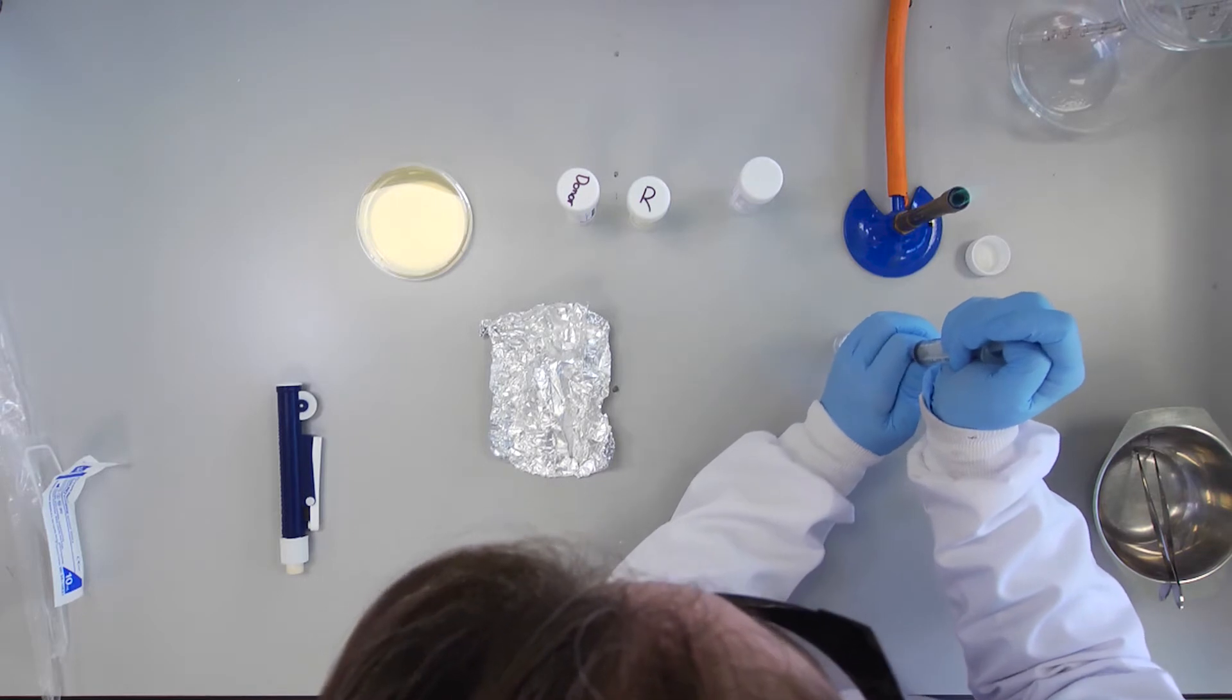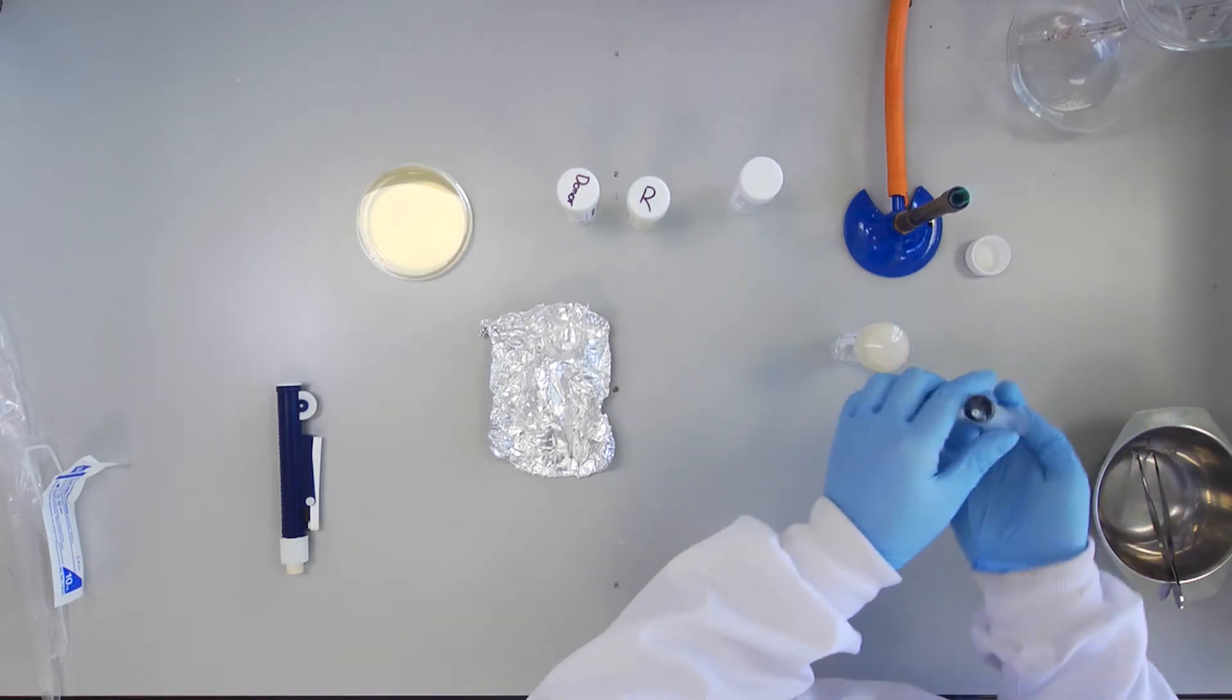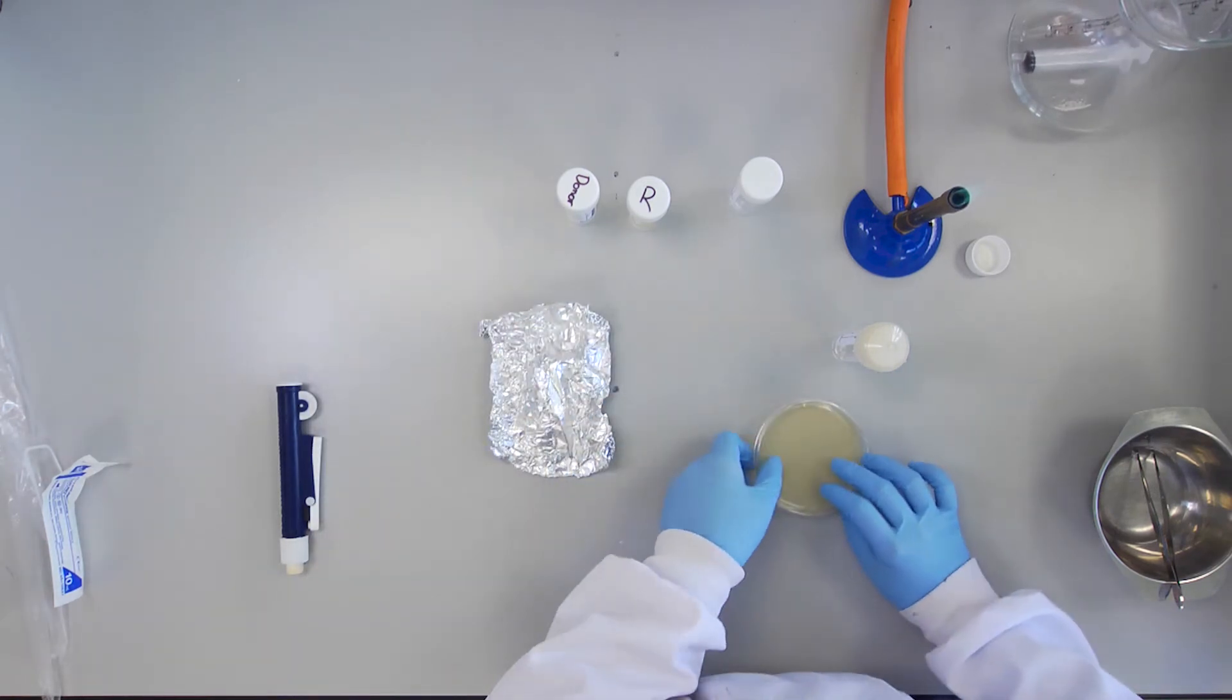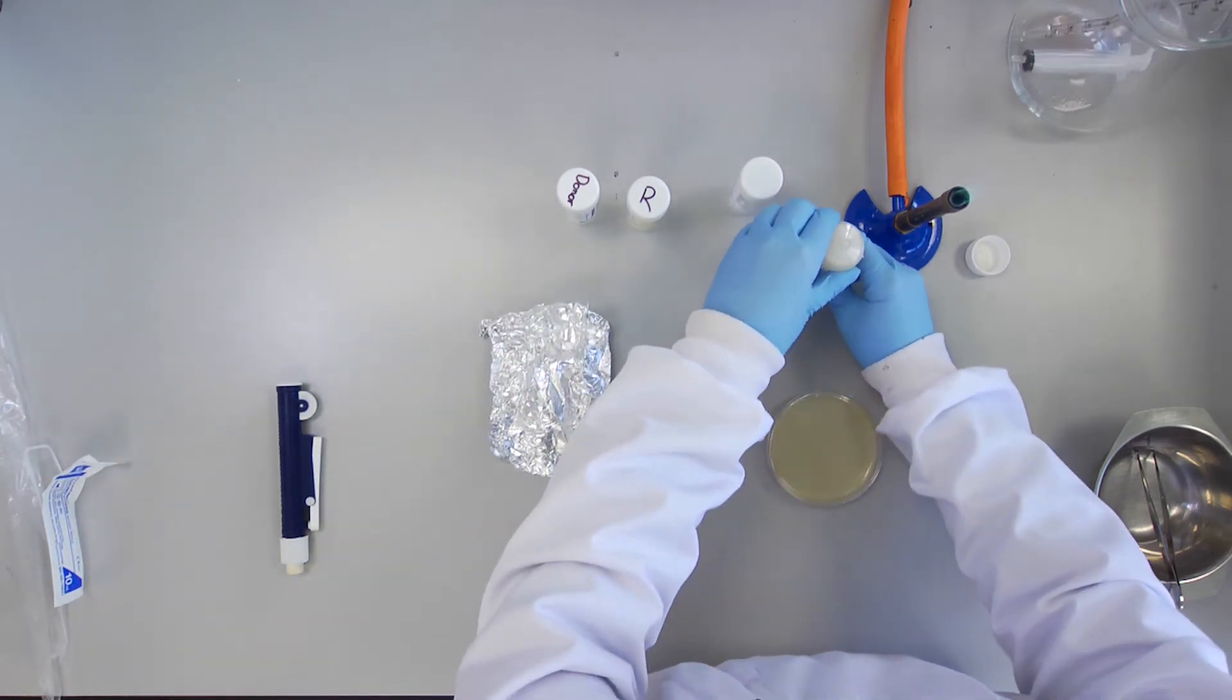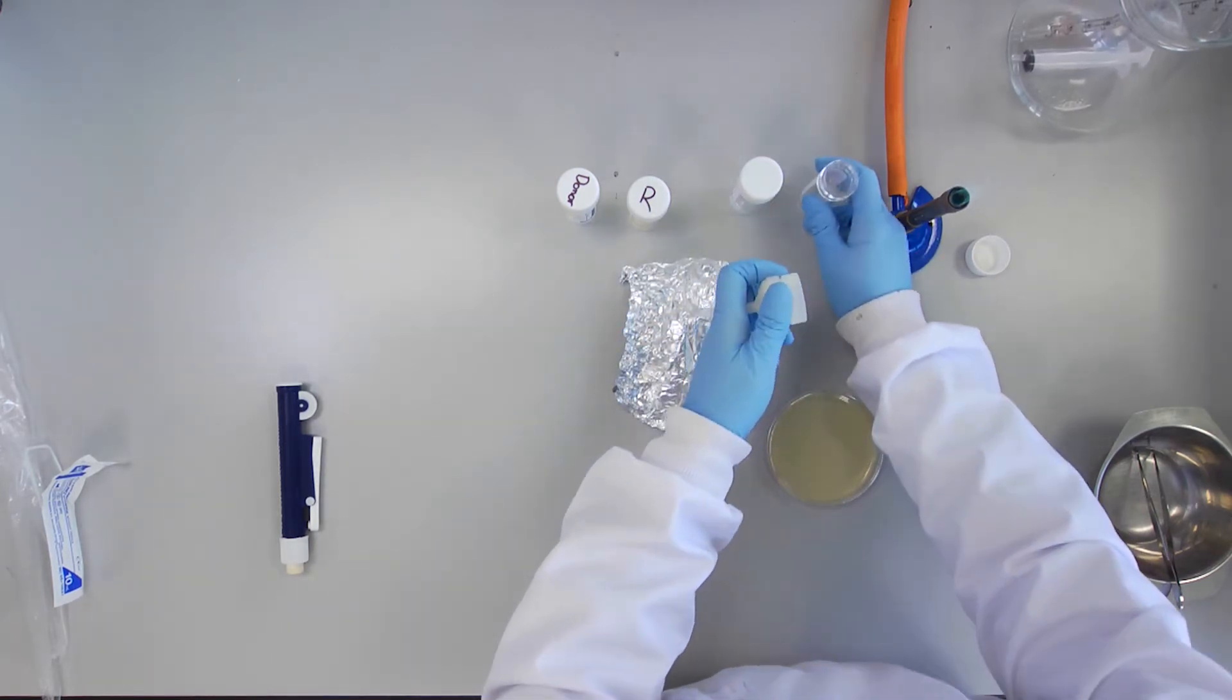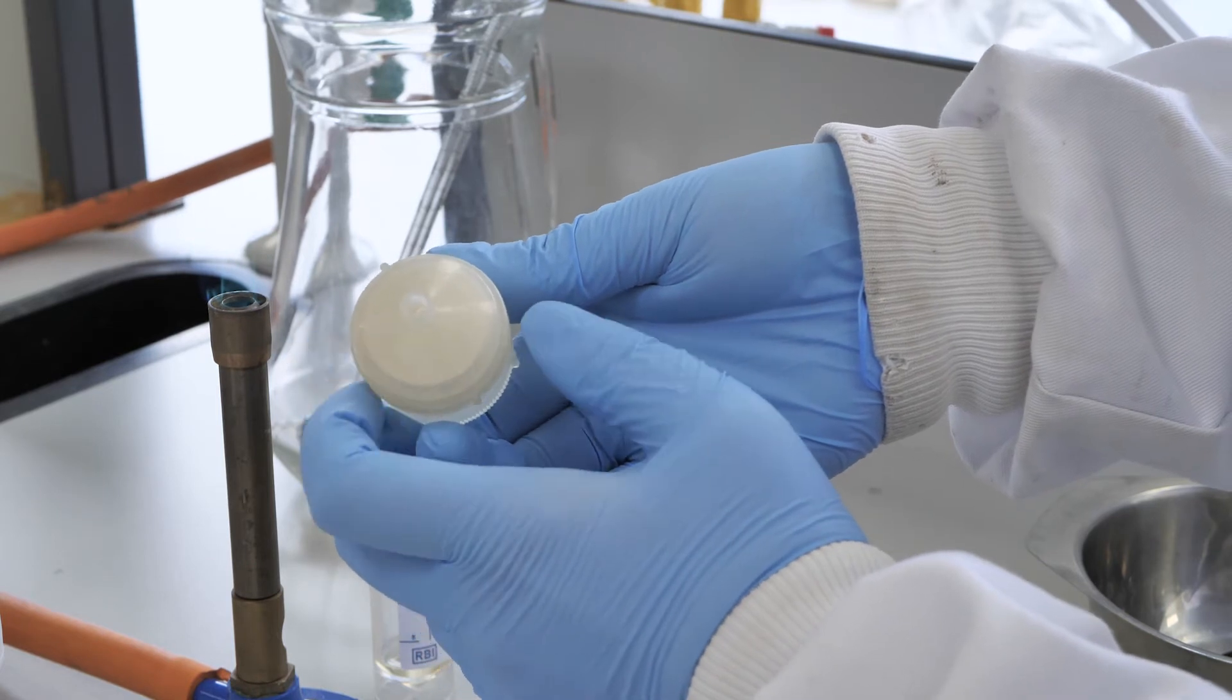Do not allow the plunger to snap backwards as this may rupture the membrane filter. Remove the Swinex from the top of the universal. Open the Swinex filter.